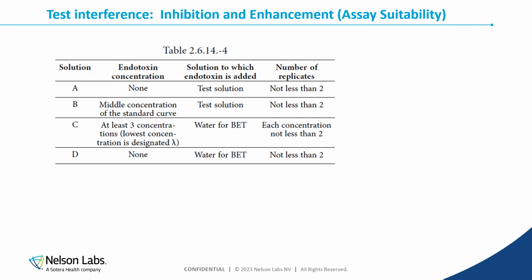This is actually included in each and every single assay that we perform in the lab. So I always answer customers that come to us with the question, "I have to validate my assay," well, you can do it, but it should not be a separate assay. Actually, this is what we do in each and every assay. So each test that we do validates its own result.